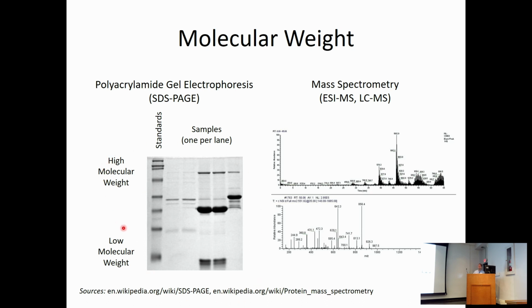If you're expecting a protein that has a molecular weight of 5 kilodaltons, and say, for example, this one where you see these 3 bands, well, this tells you that your protein isn't pure. There's other stuff there. But if this particular molecular weight marker is 15 kilodaltons, then that gives you an estimate for what the sizes of the other bands are. And in the extreme case, you can cut these out and run them in the mass spec to get a really, really precise molecular weight.